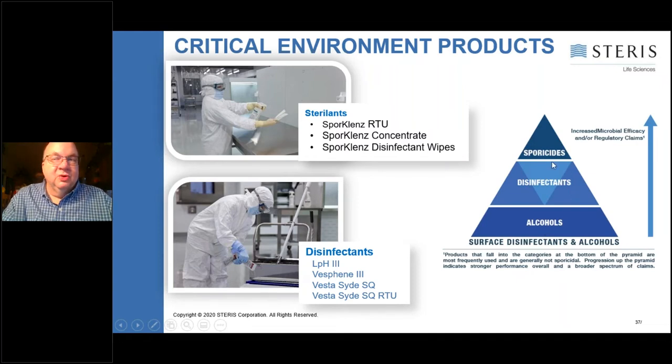The workhorse of the program, as Thomas Arista says from FDA, is in the middle here. That's your phenols and your quats. And up at the top is my nuclear weapon in my arsenal. It's used the least frequently, but would be most efficacious, and that is the sporicide.